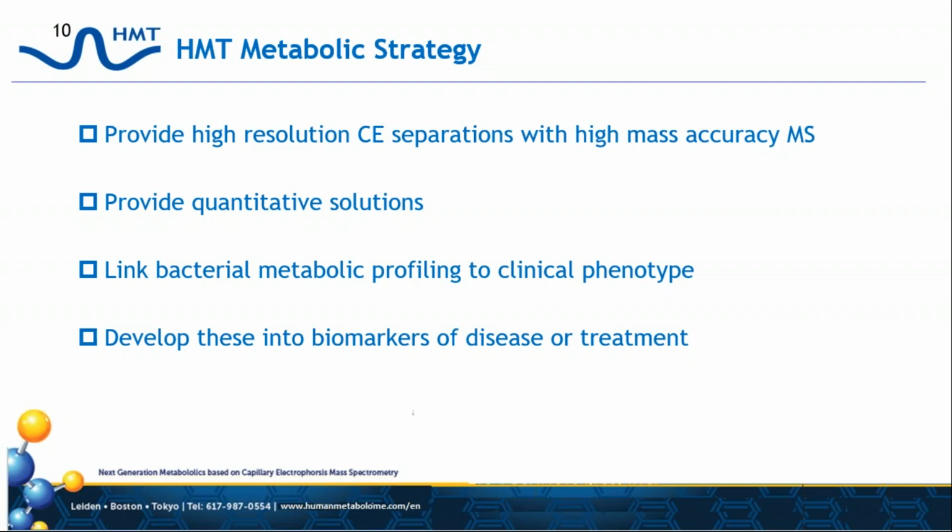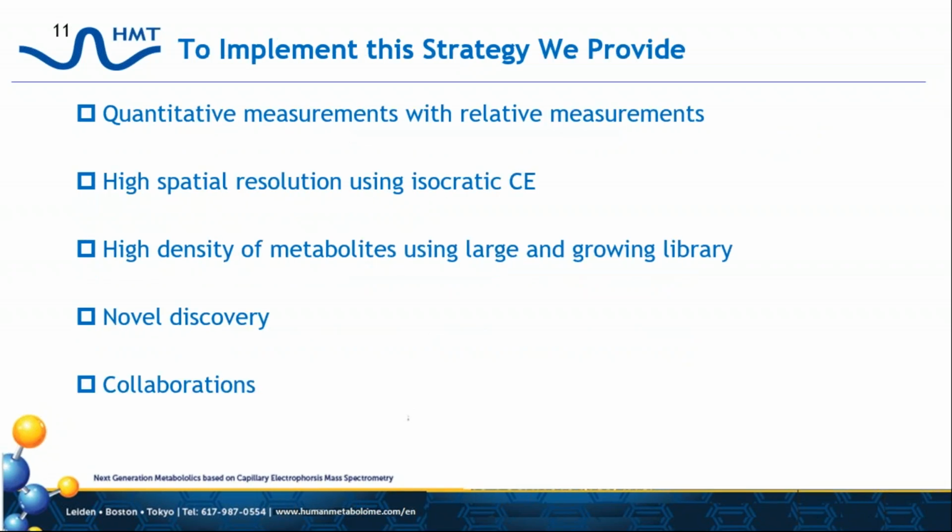And then take these profiles and link them to a clinical phenotype in order to develop biomarkers for disease, in drug development, or treatment of disease. To implement this strategy, we provide quantitative measurements along with relative measurements.